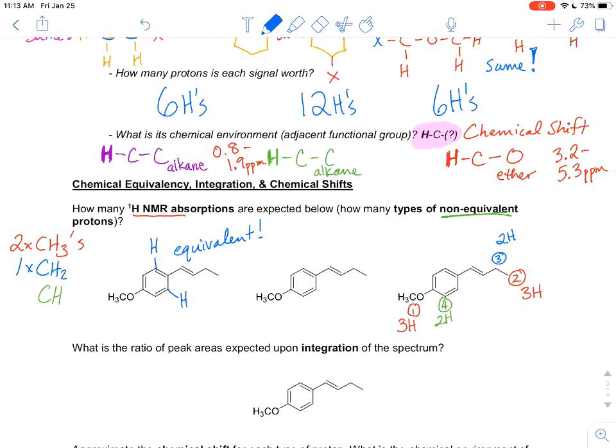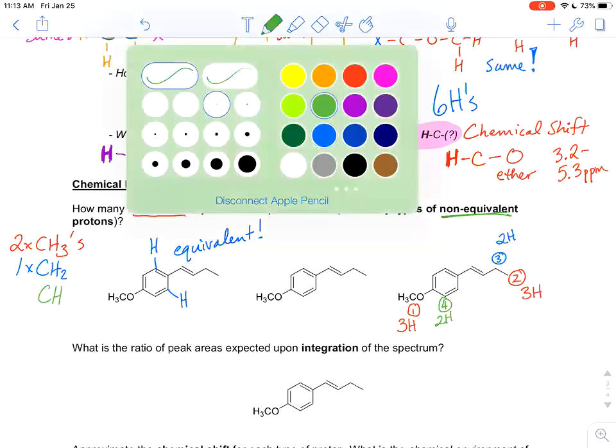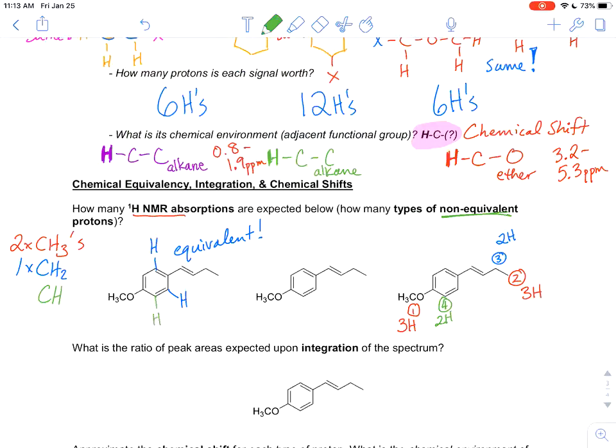Now we want to make sure of the relationship between those protons and the ones we had labeled in green. And it turns out these sets of protons, these two, are non-equivalent. They are different. Now that may be something that's clear just by looking at the structure itself, but the reason that I'm putting this video together is so you can actually use that technique to figure out unequivocally whether or not they are the same.